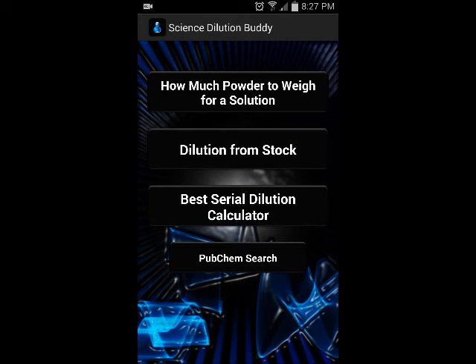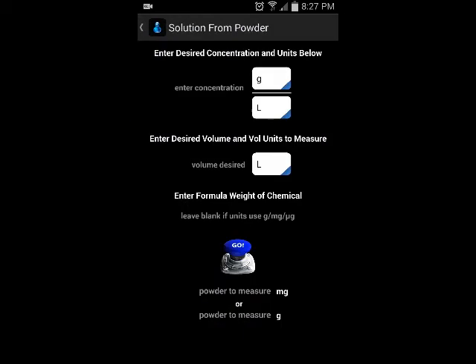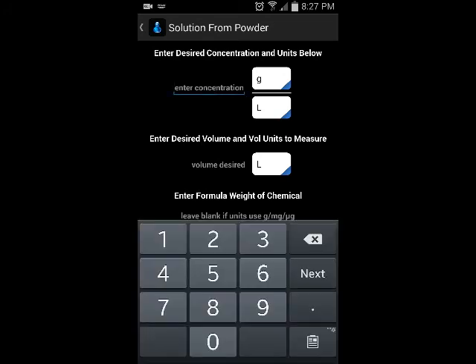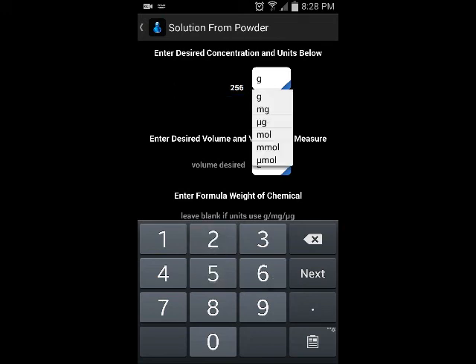First, I want to get to some of the new stuff here. We have a Solution from Powder feature. If you're not familiar with this, you can basically type right into these fields to enter whatever concentration you're interested in.